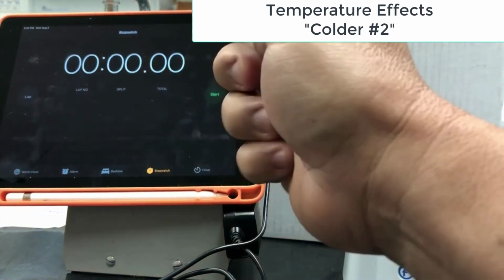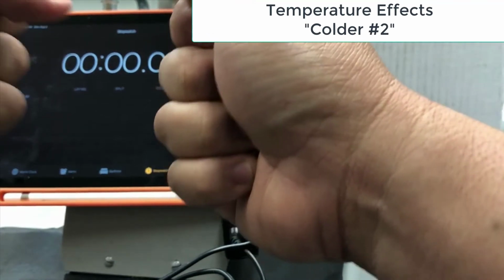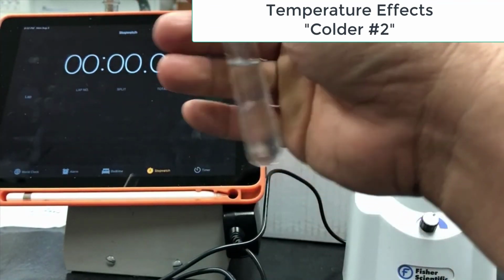Again, I cooled these down and then I warmed them up a little just by placing in my hands. Try to get the temperature up about 10 degrees.